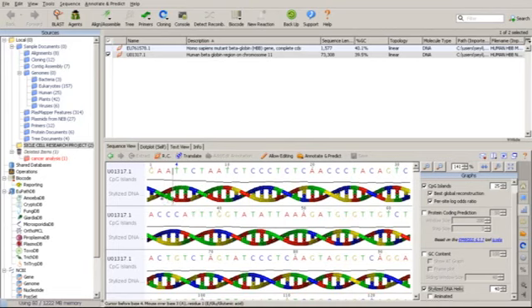Now each of these nucleotide bases has a significant color that is specific to it. So we have G. Now this G is what color? It is orange. So in the DNA structure, this G is orange, just as you can see here. Now this blue you are seeing is actually the complement of this G on the helix structure. You understand? Double-stranded DNA structure.